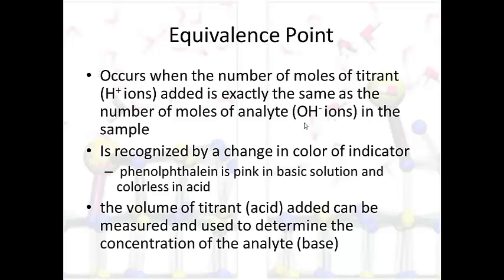The volume of the acid added can be measured using the burette that we're dispensing it with, and it will determine the concentration of the base that's contained within it, because we know that once we reach the equivalence point, we've reached the point where the moles of the acid equal the moles of the hydroxide.